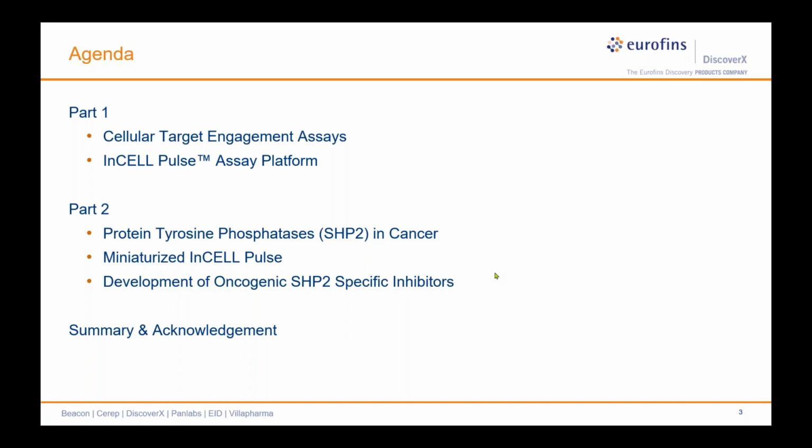Good afternoon. Today we're going to split this webinar into two parts. First, I'll give a brief introduction of cellular target engagement assays and the InCELL Pulse assay platform. And then Les Lambert will give a presentation about protein tyrosine phosphatases in cancer, miniaturizing the InCELL Pulse assay, and development of oncogenic SHP2 specific inhibitors. And this will be followed by a question and answer period.